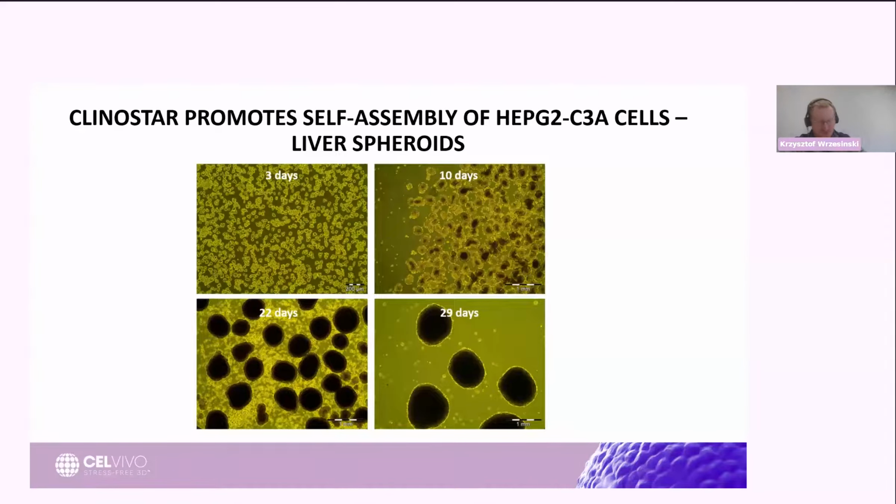I know that people are quite often using systems like this and calling them microgravity systems. I have to admit that yes, I also published papers where we used the word microgravity, and we always said that it's simulated microgravity, but it should be simulated some aspects of microgravity.